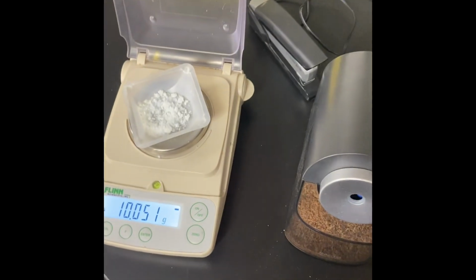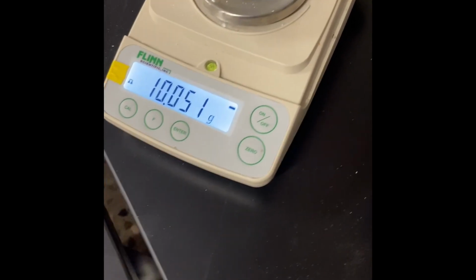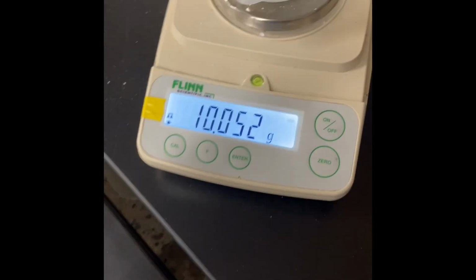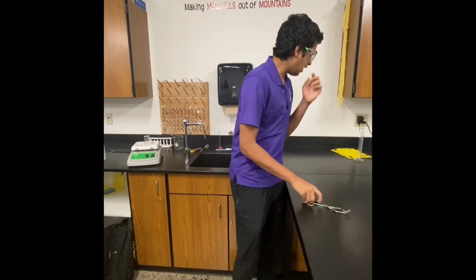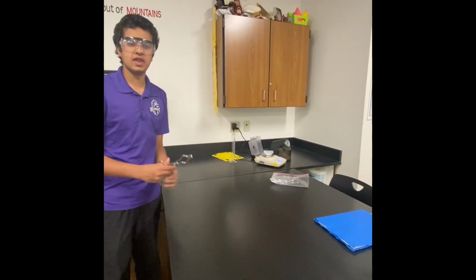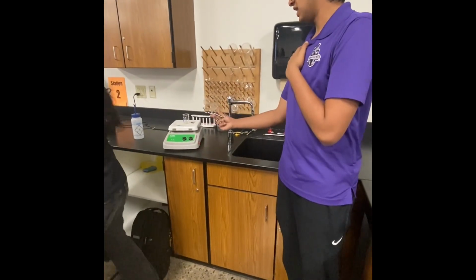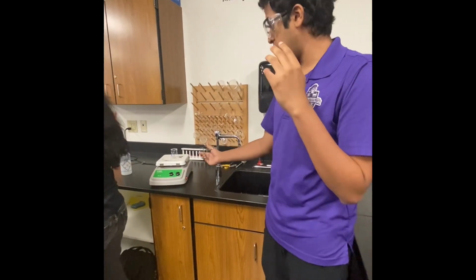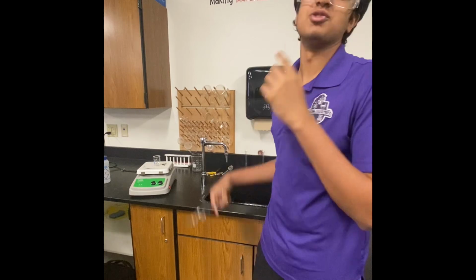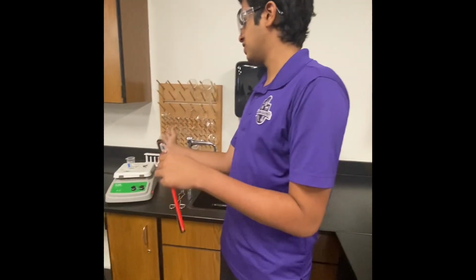So now we need to make a solution with the magnesium sulfate and some water. First we're going to measure out about 10 grams of magnesium sulfate. For the next step of the lab, we have measured 10 grams of our alum powder. To make a solution, we're also respecting ratios and making 10 milliliters of water. We're going to bring it to a boil, so we'll get back to you after I bring it to a boil.